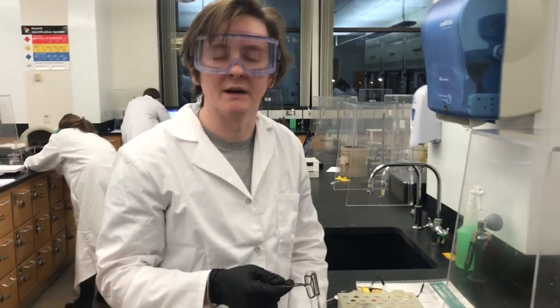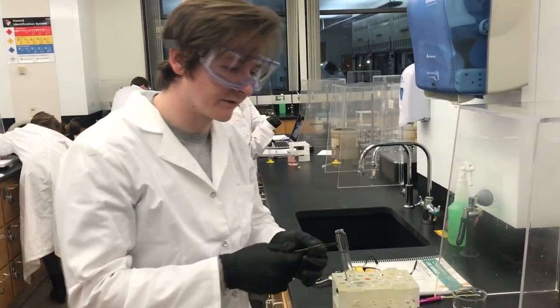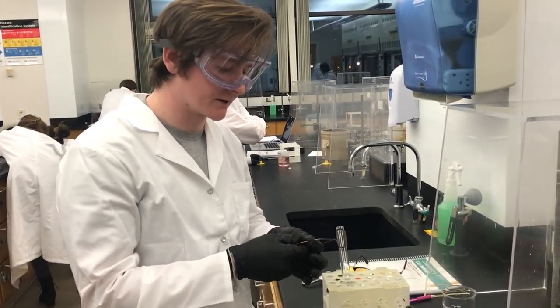My name is Ken Lee Vaughn. My TA is Alec and Section 001. Today we're going to be going over heating test tubes over a Bunsen burner.